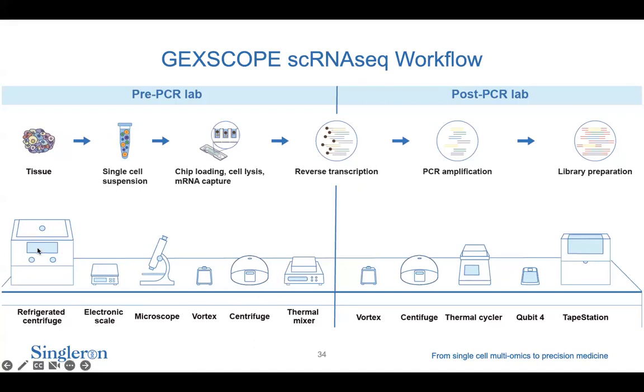So these are all the instruments that should be in your pre-PCR lab. As I already mentioned, there is probably nothing that you wouldn't already have in your lab. So basically, it's the standard equipment that you most likely already have on your benchtop.